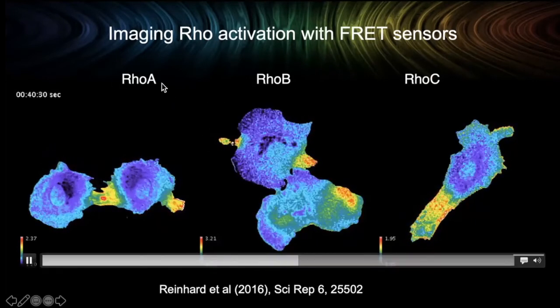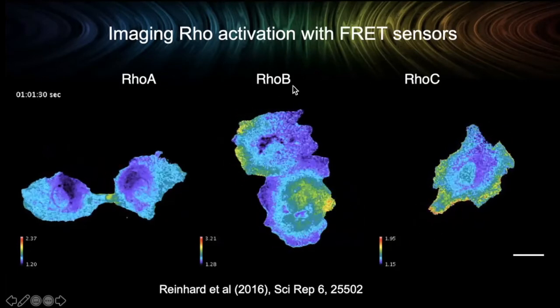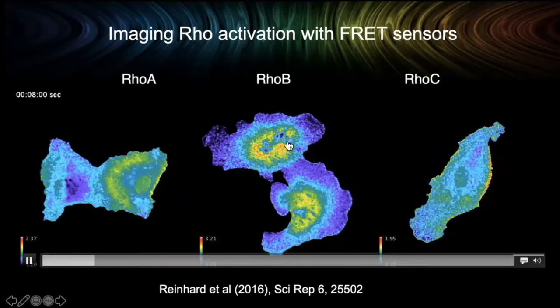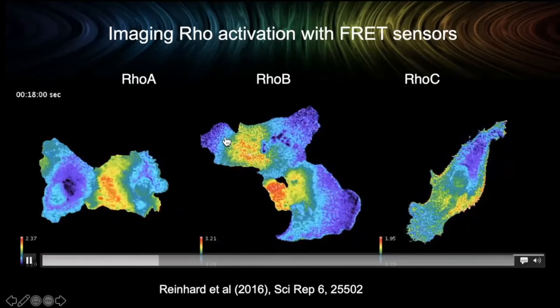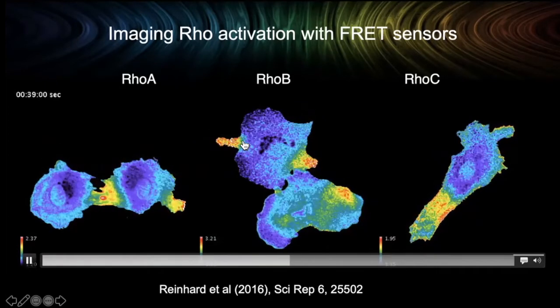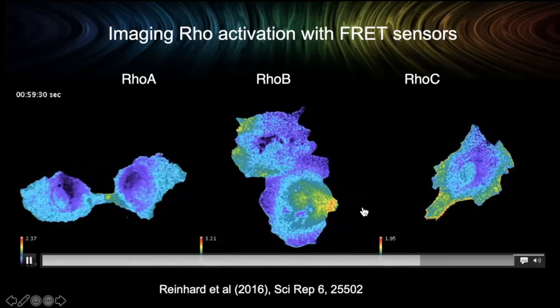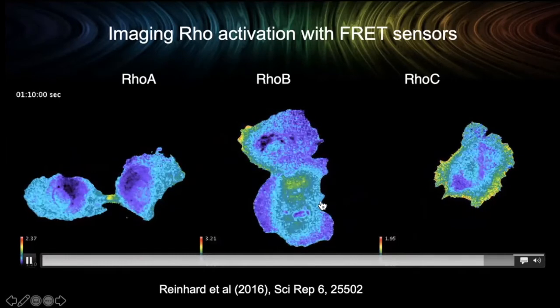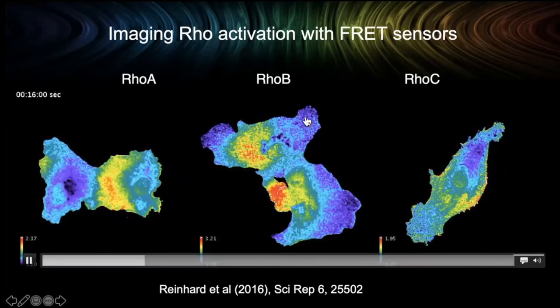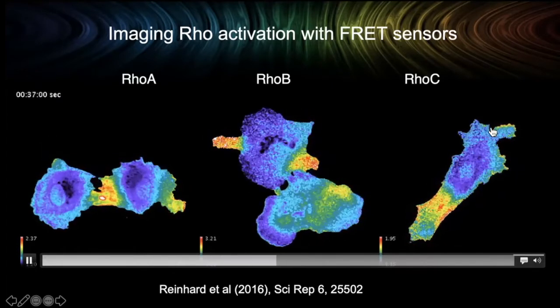And as you perhaps know, RhoA signals through to the actin cytoskeleton and is involved in contraction and in stress fiber formation. What is so nice about this small GTPase is that it signals towards the actin cytoskeleton in a way that a high signal of the sensor precedes contraction. So you can very nicely see that if the sensor is giving a high signal, then subsequently the cell will retract. And also a low FRET state of the sensor, because it is antagonistic with Rac, is predictive of cell expansion. And so you can really look for a long time at these single cellular gradients.